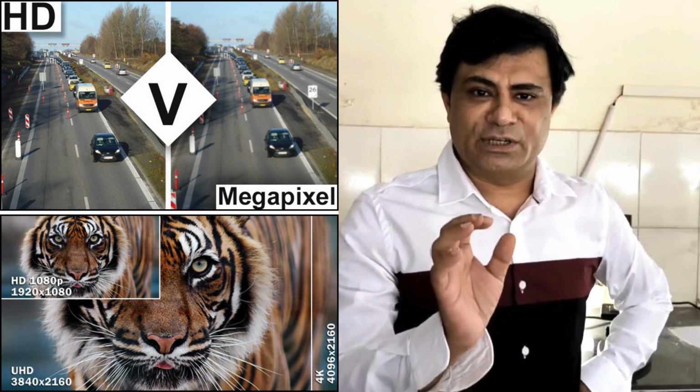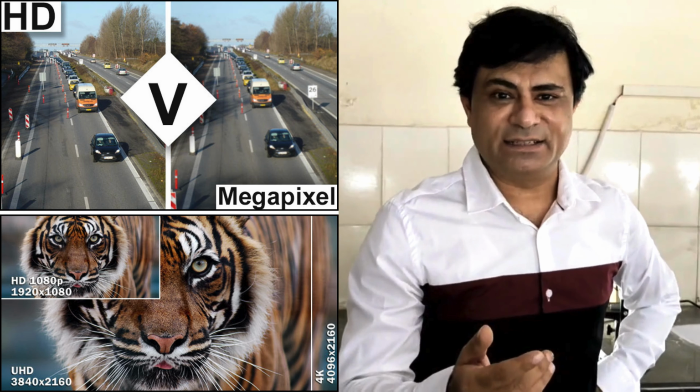All you guys must be taking good photographs from your mobile cameras these days. When you see the images and zoom in like this, the more you zoom, the images become blurred, although you're zooming. That zooming of an image is a magnification thing. But the more the megapixels, you're getting in the market 13 megapixel, 18 megapixel, the density of the picture is increased, like using high density images.